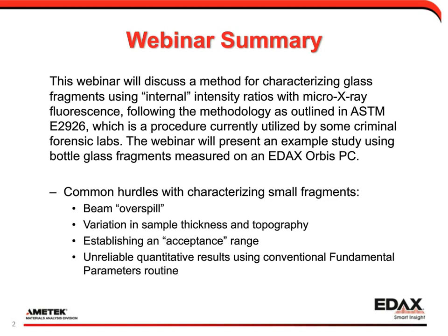Conventional XRF quantitative routines, such as fundamental parameters, make assumptions regarding the sample, and make the assumption that it is infinitely thick with respect to the X-ray response. And making that assumption on small glass fragments can lead to mischaracterization. Also, it's necessary to establish a definition for acceptable ranges for inter and intra-laboratory comparisons to establish what can be defined as coming from the same composition or what would be different.